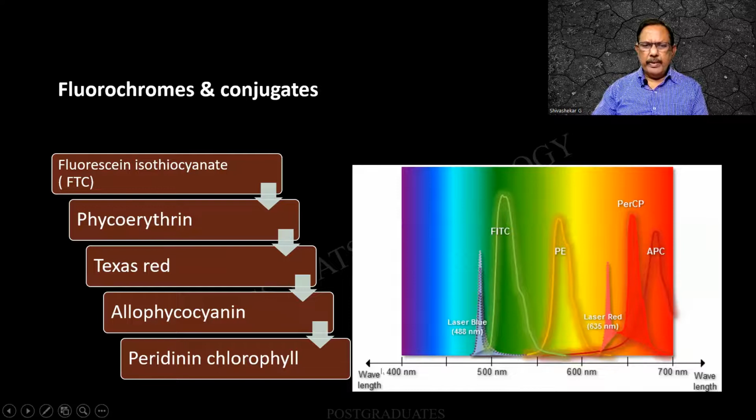I would like you people to kindly memorize this so that you will be able to mention the different chromes that are used in a flow cytometer.